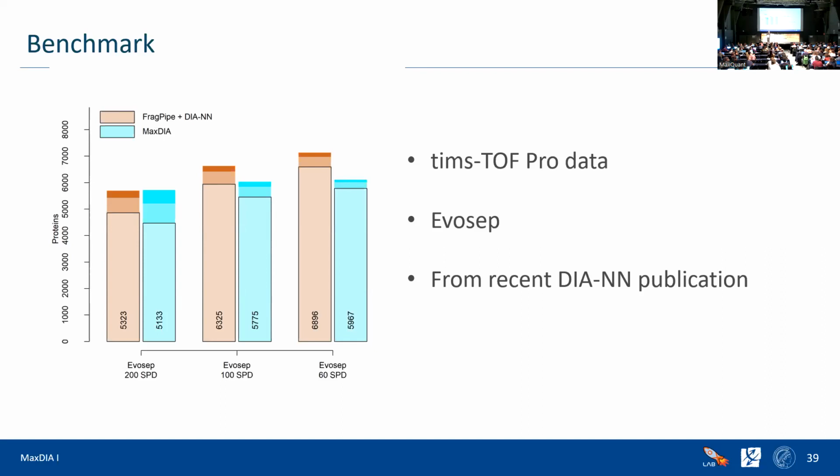It's a good thing, I think, that we have that freedom now. And once we go to simple predictors without deep learning that can be trained on your data, you could make a retention predictor trained on your data, and then it can make a discovery library that exactly fits your samples. Thank you.